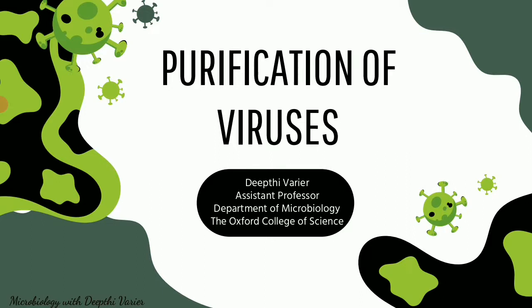So for purification of viruses, or when we say pure form, to obtain the viruses free from any contaminating material such as a cell or the cell extract, we need to apply certain techniques which we are going to look into today. Now, none of these techniques are foolproof and no one technique is considered the gold standard for purification of viruses. Every lab has their own optimized, standardized technique. But these are some of the basics of the current techniques that are being employed in the industry.